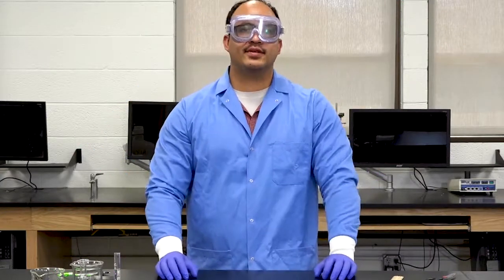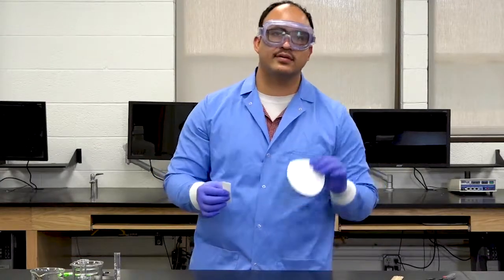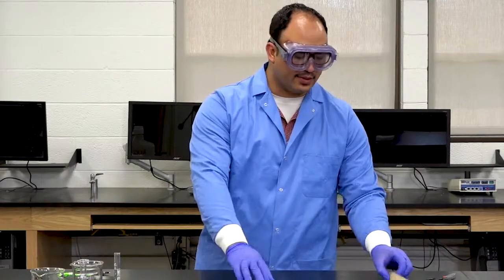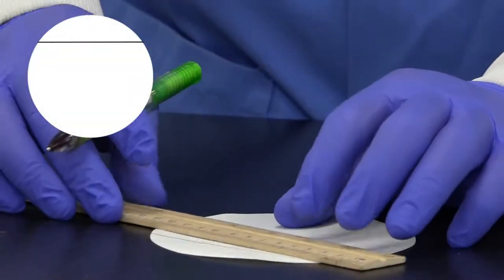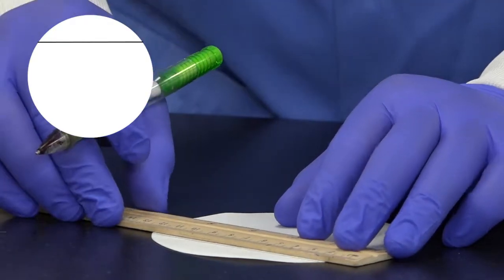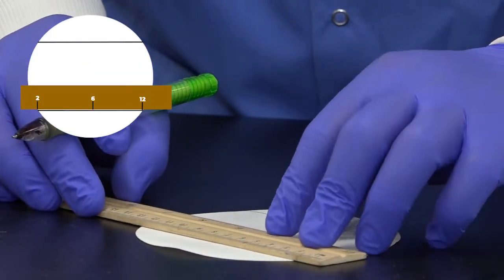For the paper chromatography experiment, we will first be making our chromatography strips. These are made from filtration paper, which is here. We're going to mark a straight line at the top of this paper, and you want to get an idea of the length of your line. So I have here from 2 to 12 centimeters. I'm going to look for that 2 to 12. Get it somewhat straight.